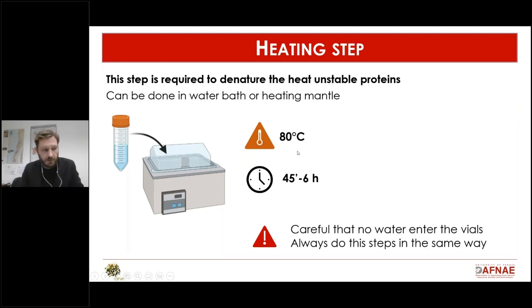Because if you want to test samples over a repeat or a series of days, it always needs to be the same temperature, the same length, the same volume in the vials, and so on.